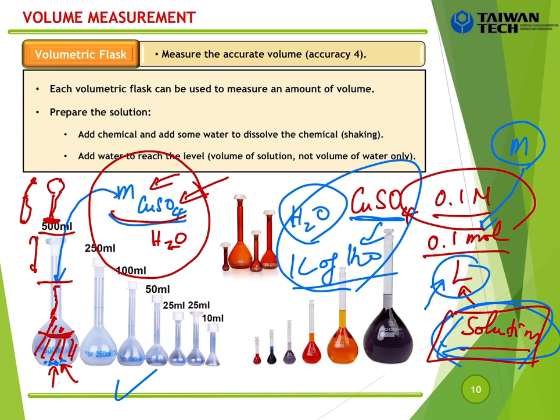And remember, when you add the water from here to here, you can use the beaker, or maybe the water bottle is okay, you can add water easily. But when the liquid level is already here and you want to add more water, you cannot add it using the beaker, because maybe you add the water over this level. Over this level, it means that everything is incorrect. You need to make the preparation again. Only until here, because over 500 milliliters, the concentration has already changed, and we don't know how much it differs, so we also cannot calculate.